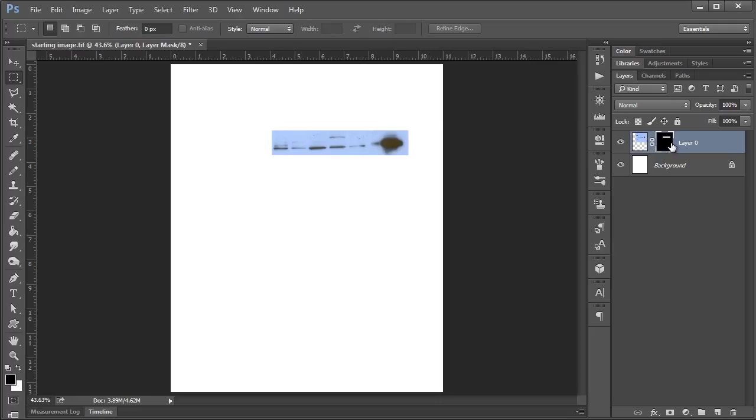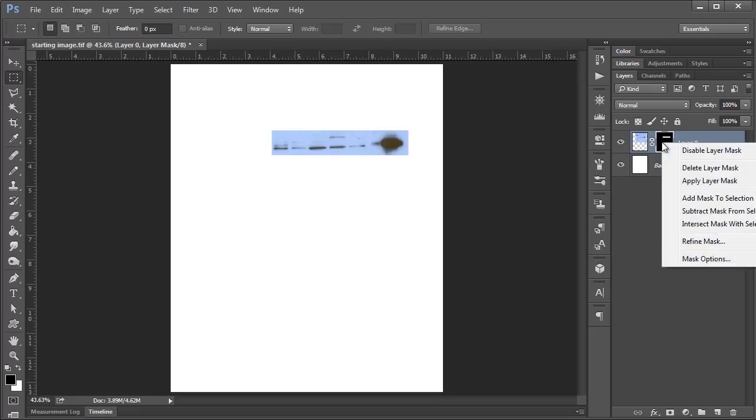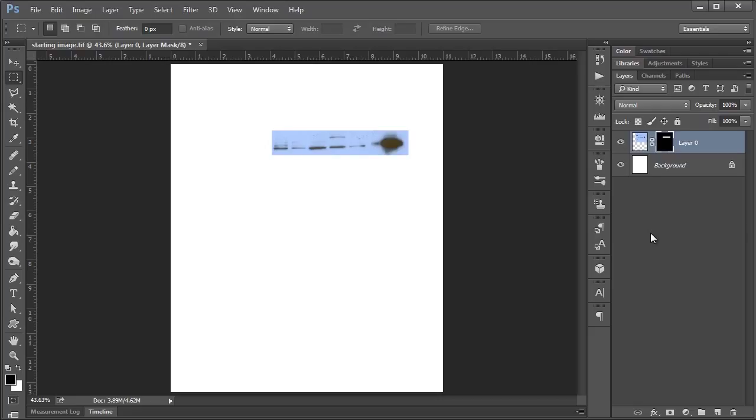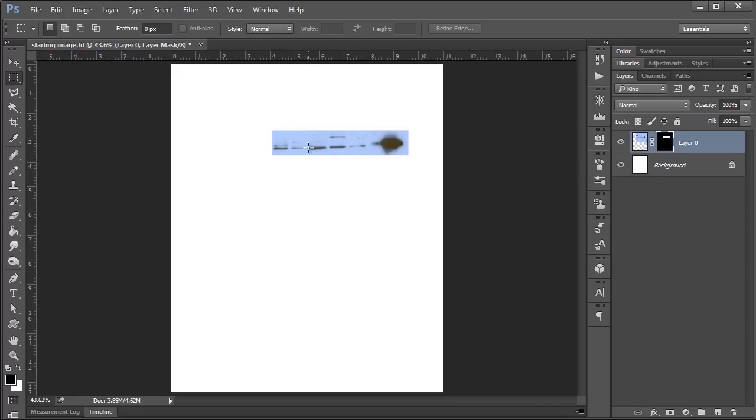I mean, it's pretty straightforward, but if you want to delete your layer mask, you can hit right-click and say delete, or you can just drag it into the garbage can. But I think that's really all there is to masking, at least in the most rudimentary sense. Masking can get super complicated if you're working with photographs or other sorts of graphics. But for the purposes of our science, I think this should be enough really to get you going. The important thing is that you've retained all of your data while just keeping the area in your figure that you're interested in.